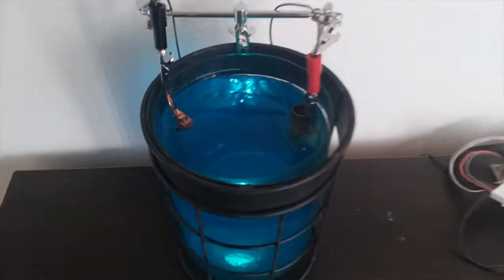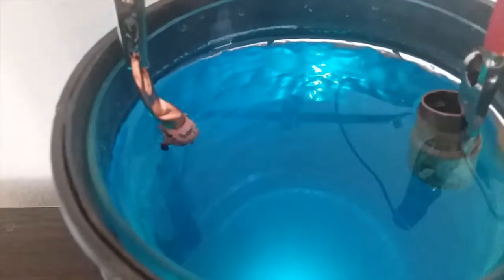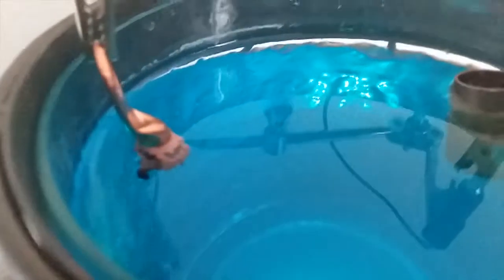Here we are the next morning. Some definite crystal growth. That line where there's nothing was because I was putting some shirts in my dresser, which it's sitting on, and it sort of knocked some of it off. It's very brittle.